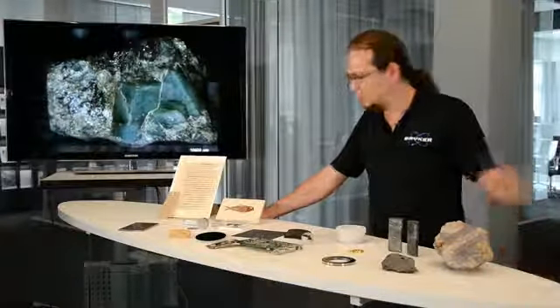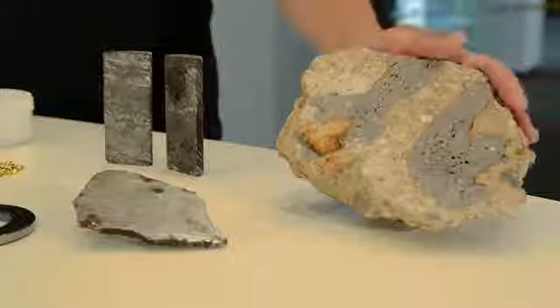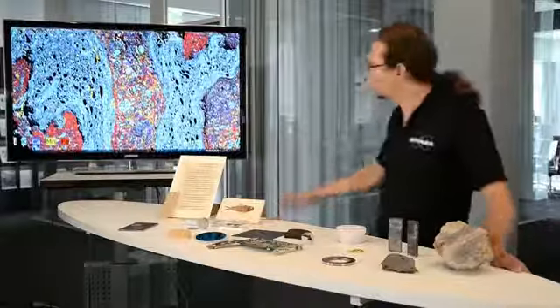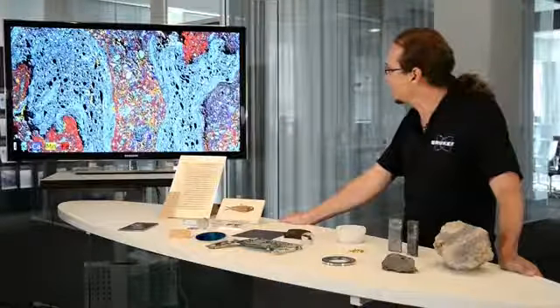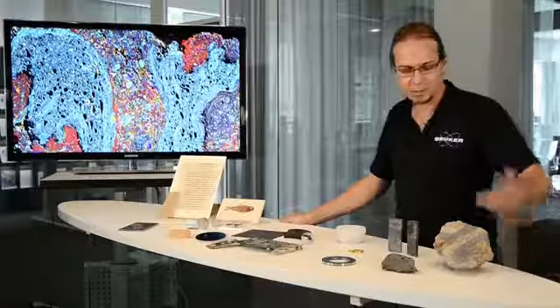Most samples as you see here on this table are non-homogeneous and we have different examples covering geology where you can measure with the focused X-ray the distribution of the different elements within the surface exposed to the measurement.